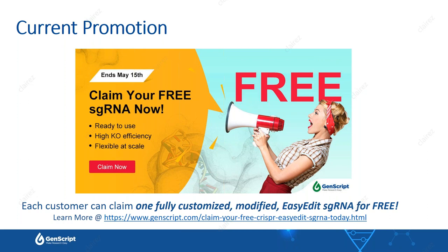Which parameters of guide RNA? So I think it's mostly the design of the guide RNA, essentially. And also, of course, the purity and the quality of the guide RNA. If you're talking about design, I think the big issue is the danger of off-target, which can be determined by online software.